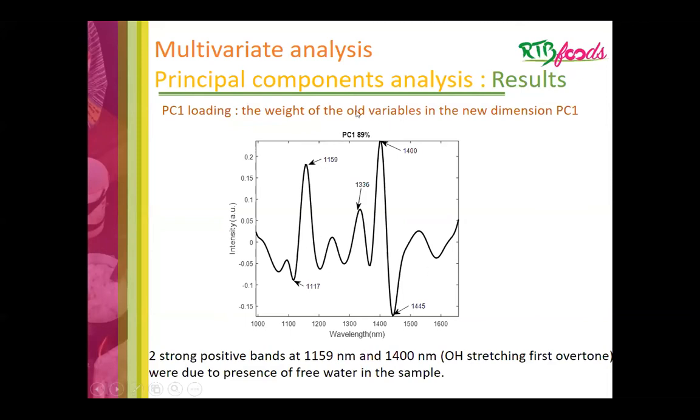Here in this loading plot, we see two strong positive bands at 1159 and 1400 nanometers. These bands are due to the presence of free water in the samples.